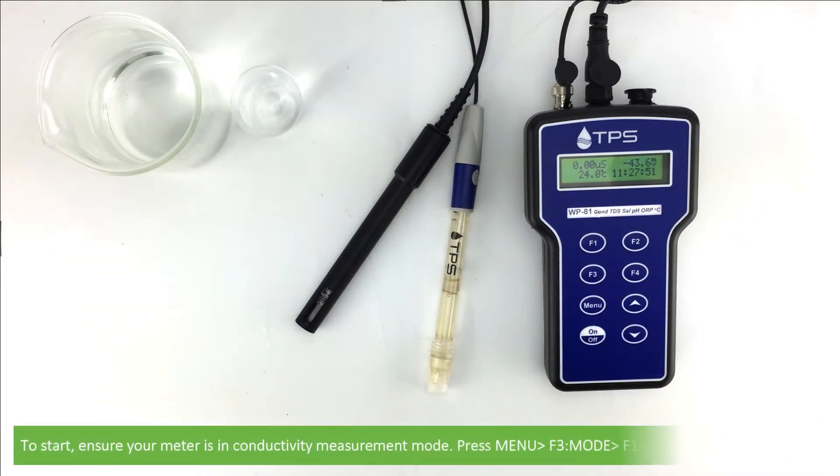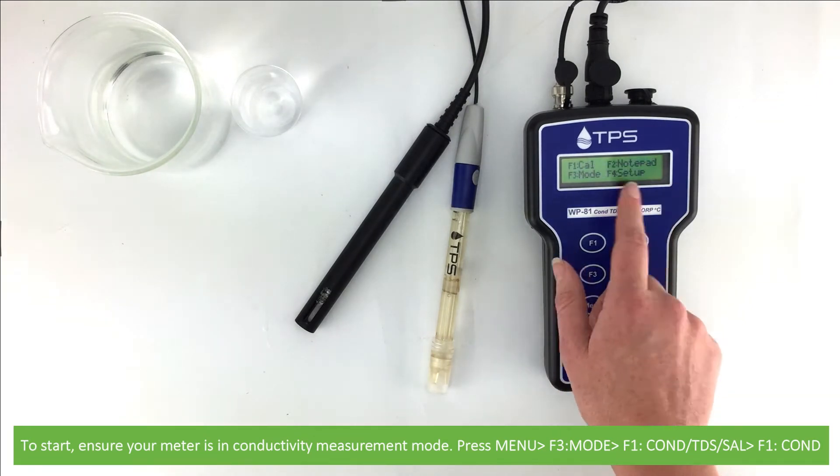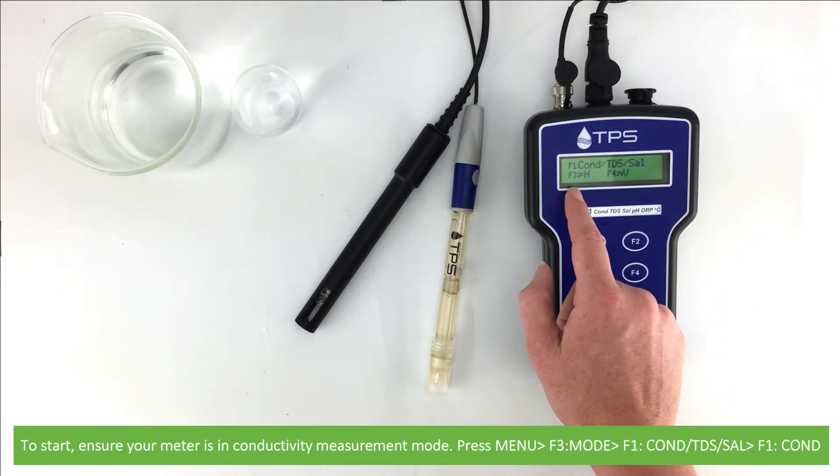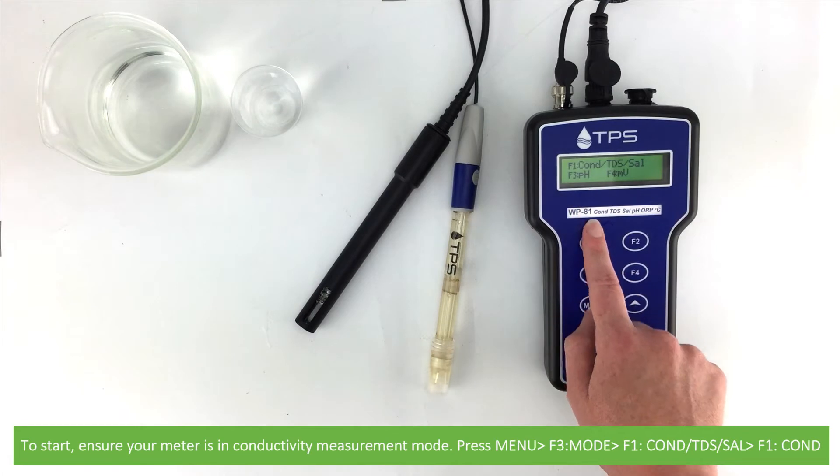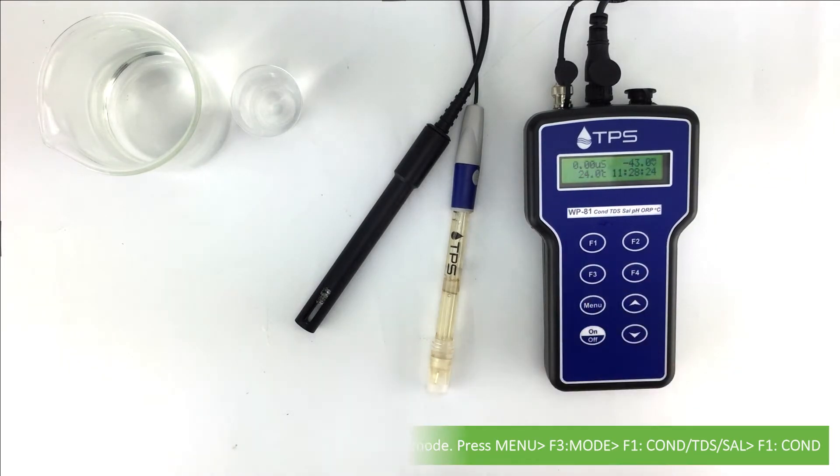To start, ensure your meter is in conductivity measurement mode. To do this, press menu, then F3 mode, F1 conductivity TDS salinity, then F1 C-O-N-D.